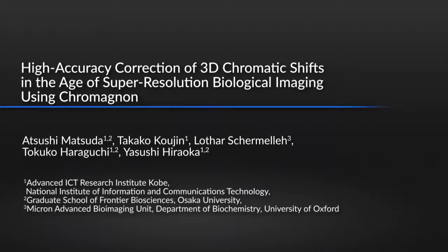Multicolor microscopy images contain chromatic shift in 3 dimensions that impair colocalization analysis of high-resolution images. It is generally difficult to remove chromatic shift originated from a biological sample itself. Our method can correct chromatic shift in the biological sample using separately acquired reference images.